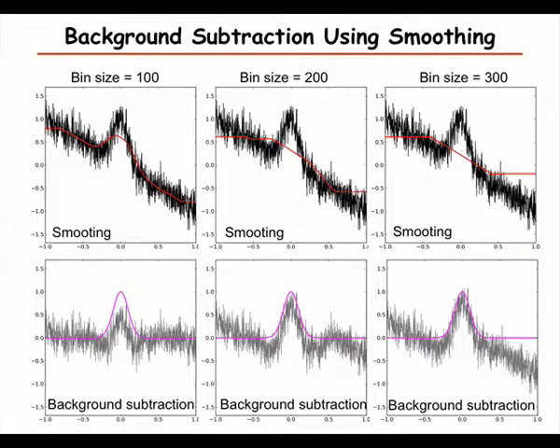So this is something that we often have to do, when signals of different frequencies are overlaid. This is quite a common thing, that we have both noise that's very high frequency, and then we have low frequency components like this slope in this case.